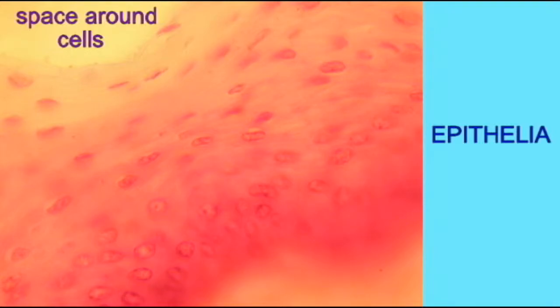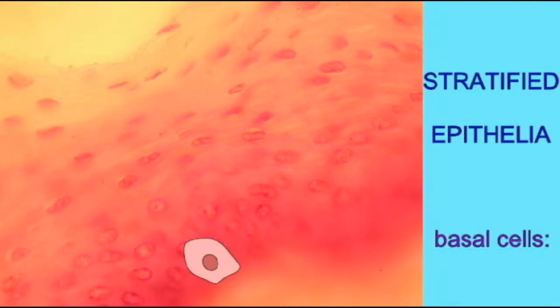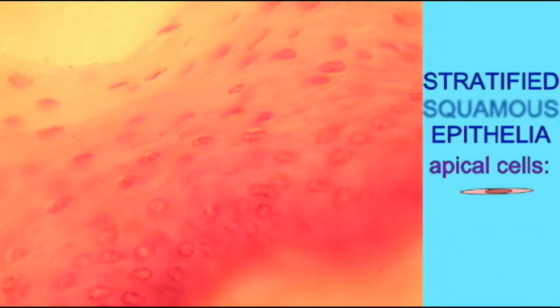This human epithelia from the oral cavity is classified as stratified squamous epithelia. It is stratified, meaning that there are many layers, and the apical cells — the cells which face the lumen of the oral cavity — are squamous. And so, although the basal cells have a different shape, being more cuboidal, the tissue is named for the apical cells: stratified squamous epithelia.